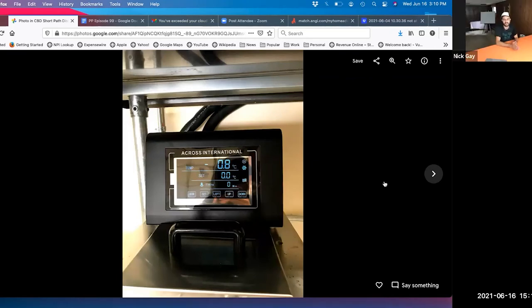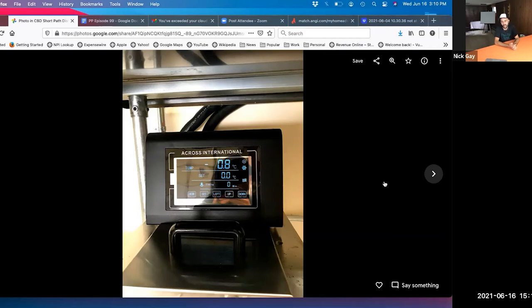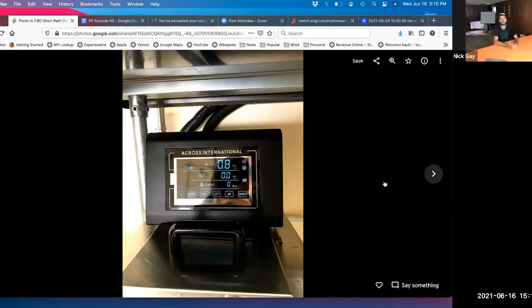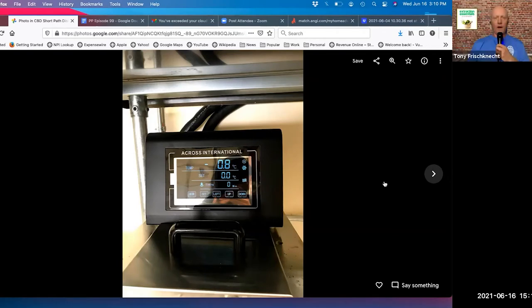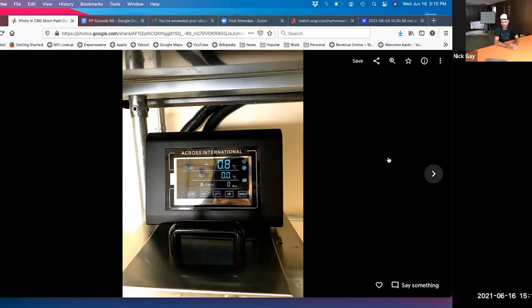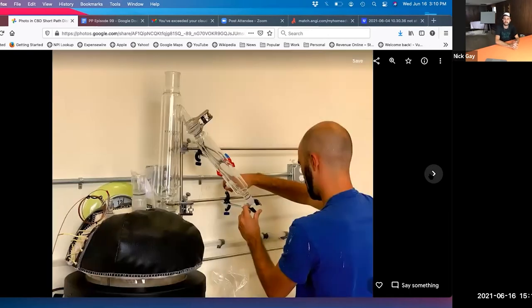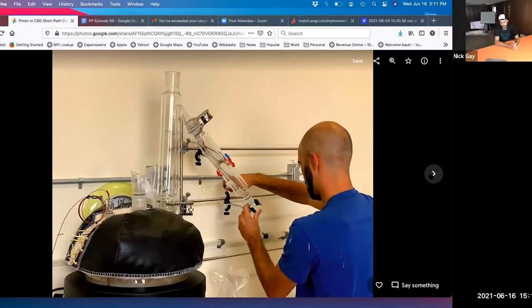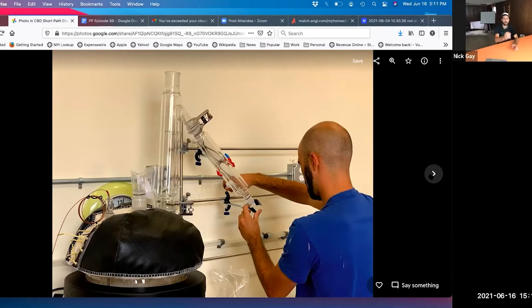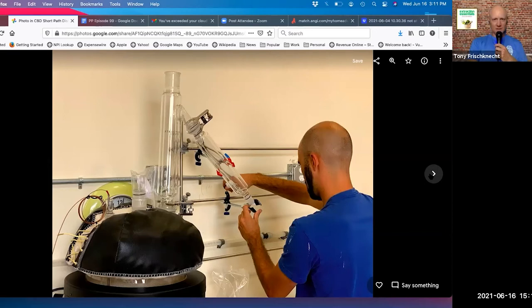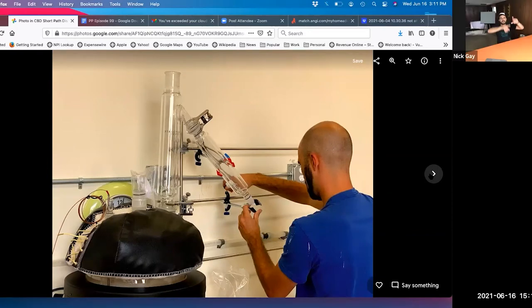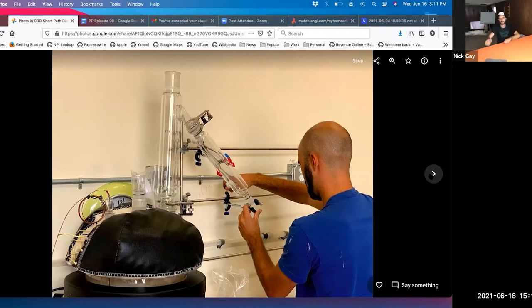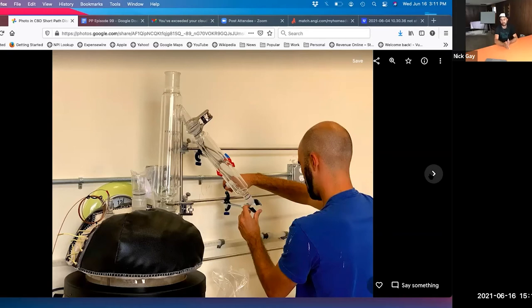This thing looks expensive. It's a little under two grand for this specific piece. Nothing's cheap if you're trying to make quality. As we move to the next picture, you'll see me setting up all the glassware here. That big tall column is the condensing column. The different compounds go up there through this reflux condenser and then travel through this secondary condenser at a 45 degree angle.